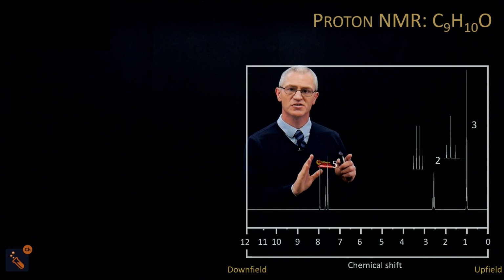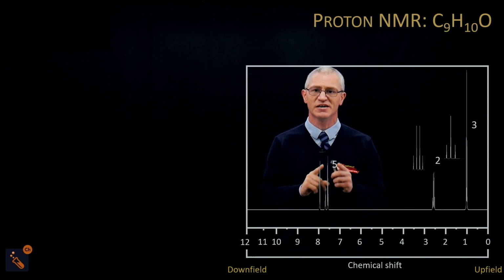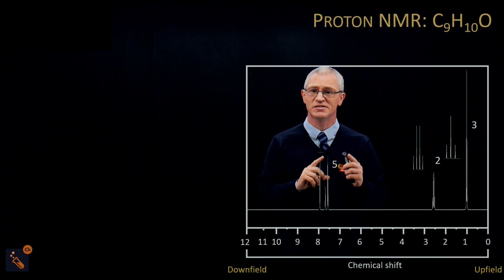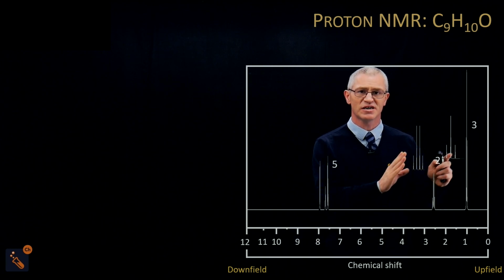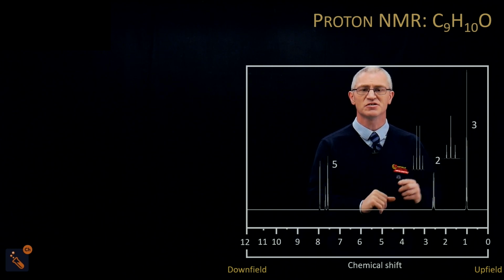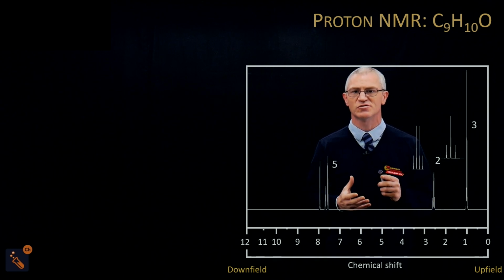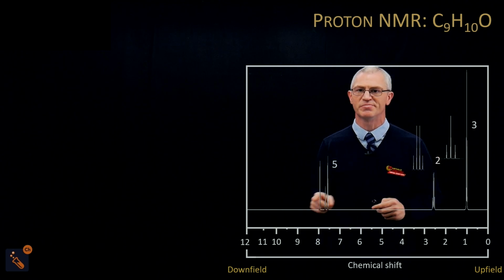We have got, first of all, between 6 and 8, we can see we've got benzene, and it's mono-substituted because of the 5 here. There should be 6 hydrogens on a benzene. There's not 6 hydrogens, it's 5, so it's mono-substituted. We've also got a quartet and a triplet with a 3 and a 2 relative peak area. That is characteristic of an ethyl group, and if you're not sure about that, you can go over video 1 in this series. So we've got an ethyl group and a benzene group.